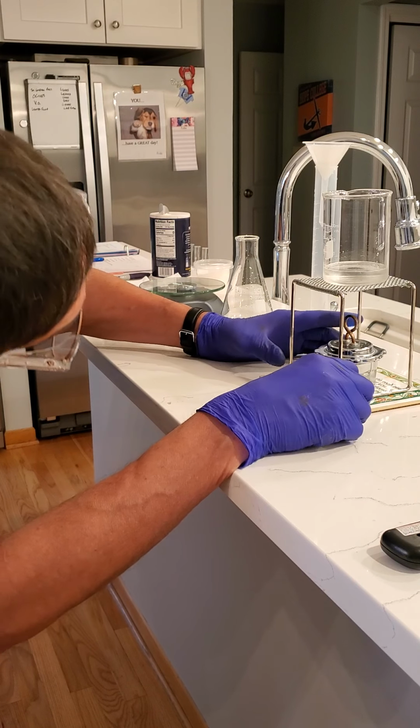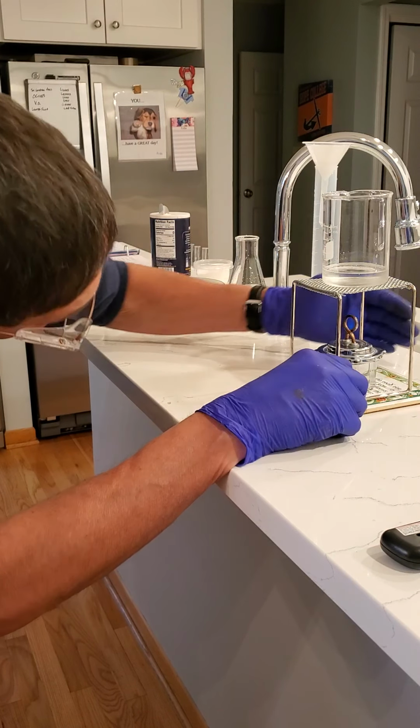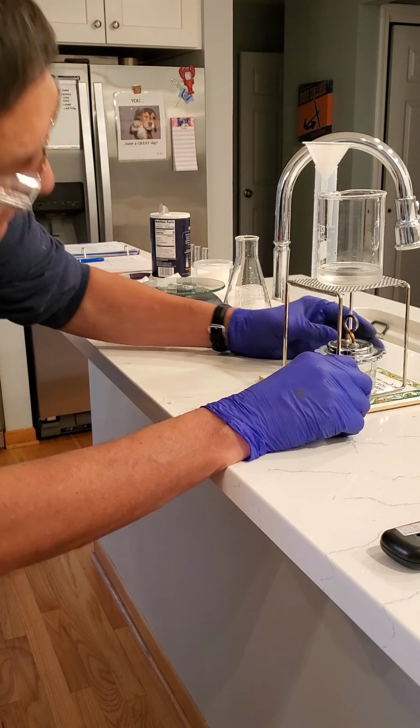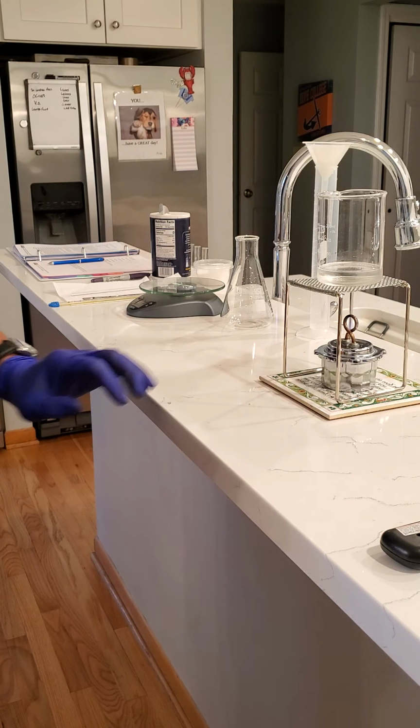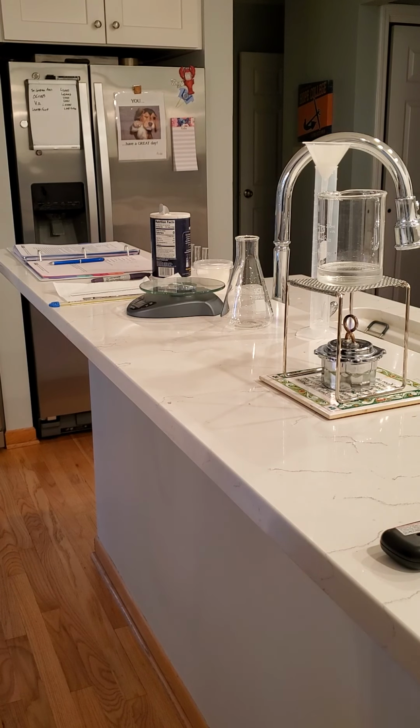And we can see that it's warming up a little bit. We do have our flame going. And so we'll let that boil gently, and then we'll let the beaker cool and weigh it after the water has evaporated. Okay, we'll be back.